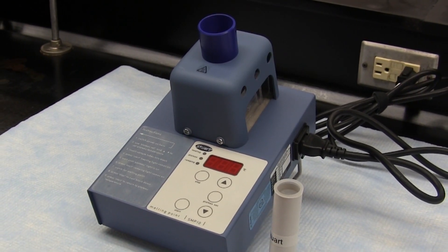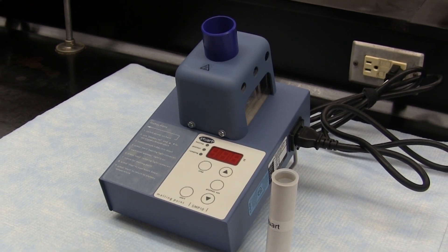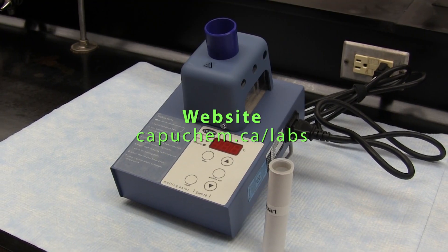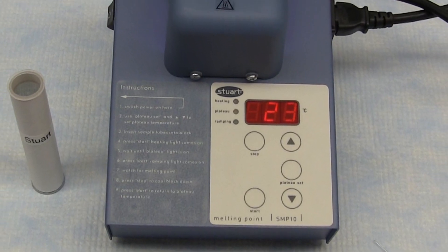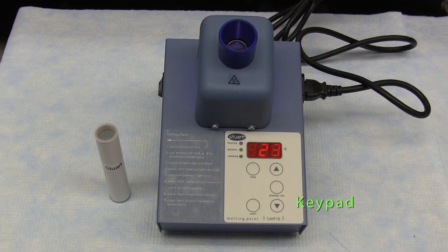Separate videos on each of these other melting point apparatus are available on our YouTube channel and can be accessed via our website at capuchem.ca/labs. The Stuart Melting Point Apparatus uses a simple keypad where the temperature is selected, measured and displayed digitally. Temperatures are displayed to one degree resolution, which is typically the precision used in reporting melting points obtained in preparative organic chemistry.